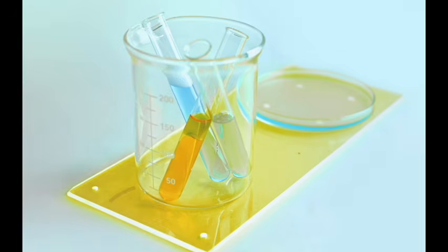You put your samples, and after you put your samples, you put 2 drops of universal solution. After you put 2 drops of universal solution, you shake, and then you shake well. Not too rough or anything like that, but you shake gently, and well, until you observe a color change. And if the color change is sustained, you take that color change and compare it to your universal chart, and then you map the color change to a specific pH.